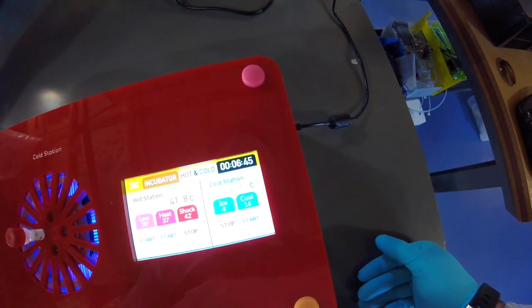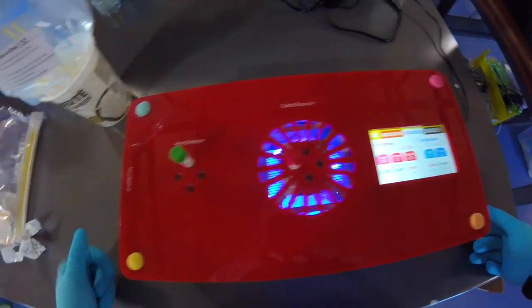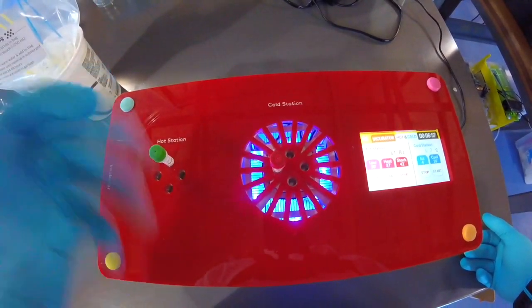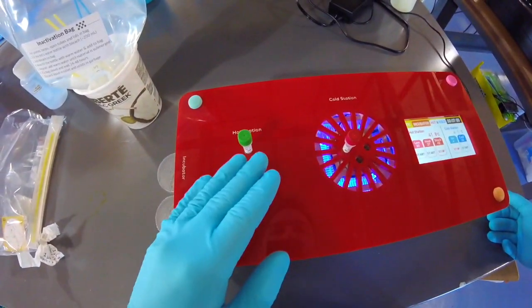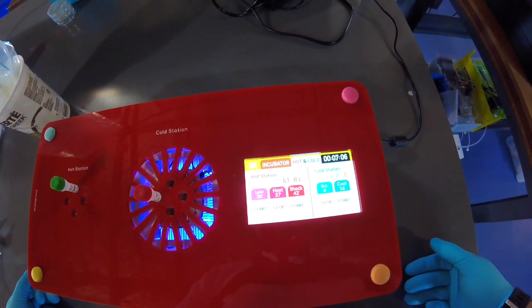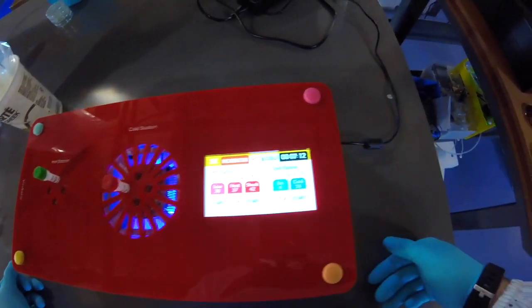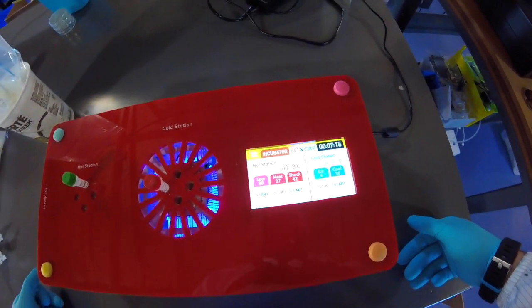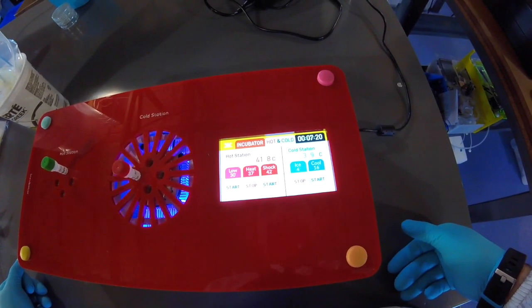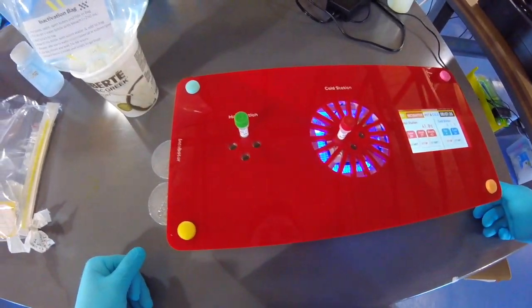So that was 6:30, at 8:30, we're going to move on to the next step, which is to pour this recovery media into this tube, and then we're going to mix it and incubate the tube on the hot station at 37 degrees for up to 24 hours. You can do it overnight or up to 24 hours. Okay, so again, this is going to slowly cool down to 37. If it's still above 37 when you reach the next step, that's no problem. It'll cool down pretty quickly, and it's not going to harm the cells in any way.